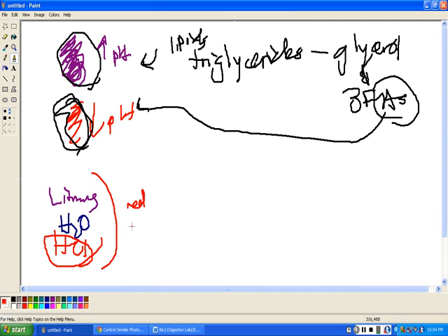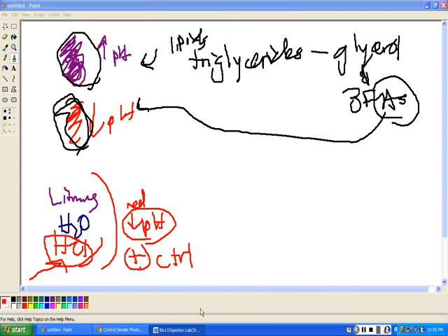Because we're adding HCl, a hydrochloric acid, it's going to be very acidic, so it's going to cause it to be very low in pH. What kind of control is this? Well, we're purposely adding hydrochloric acid to give us a positive result for changing to acid. So this is our positive control.